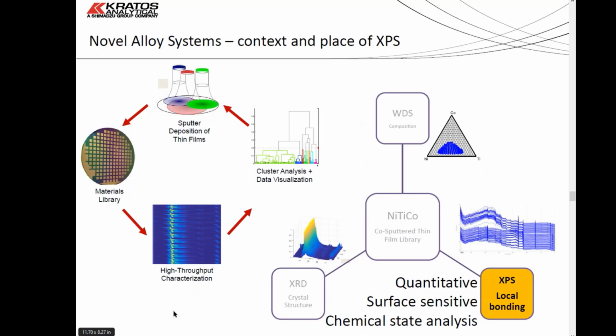So this was a project with the University of Maryland, and we weren't looking at an actual device. They were looking at entire material systems, screening large databases for material design optimization. So you've got a material library here. This was a sapphire plate deposited with 3 different metals in a deposition chamber.